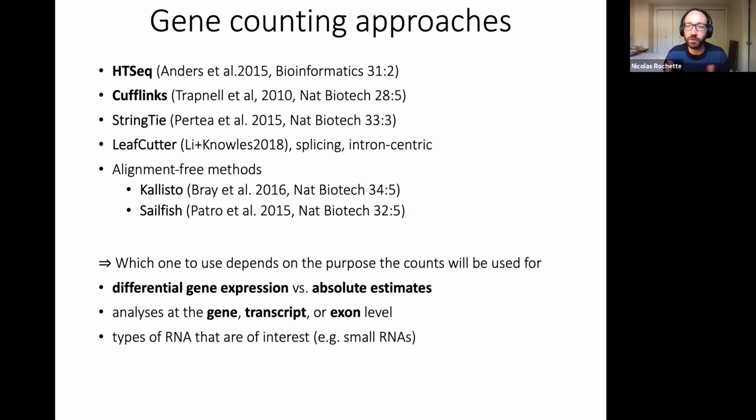But with Illumina reads, because they're so short, we're always going to have this issue reconstructing which transcript the reads are coming from. The transcripts are sharing the exons, so the reads coming from several transcripts are going to be very similar.